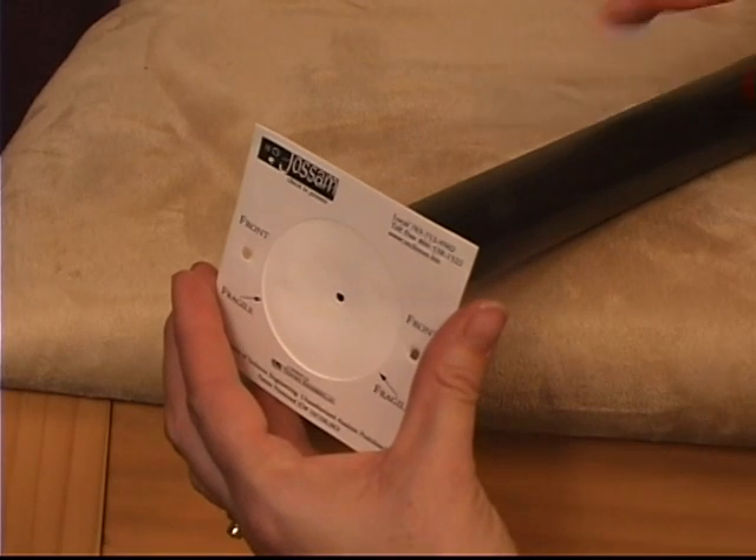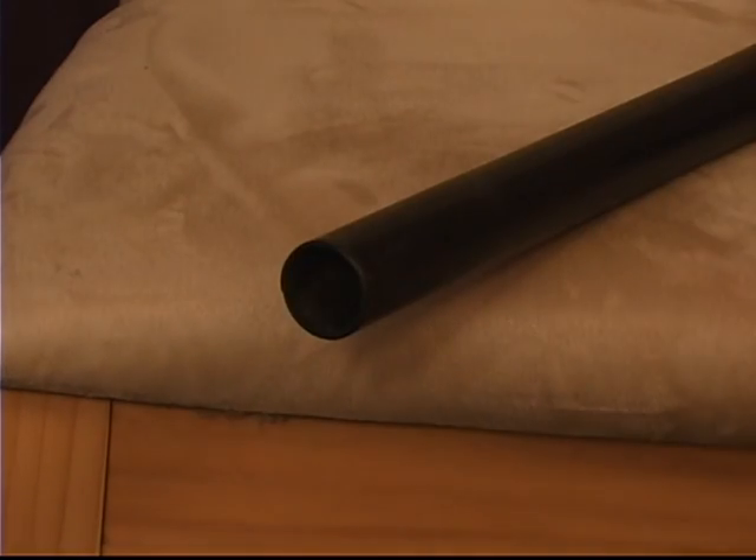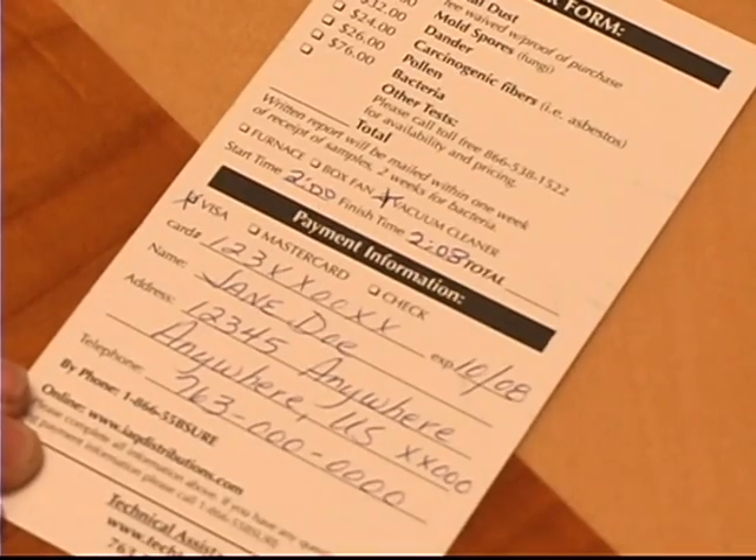Step 6. While holding the edge of the filter, shut off the vacuum and carefully remove the Jossam Sampler from the vacuum hose. Do not touch the center filter. Step 7. Record the finish time on the order form.